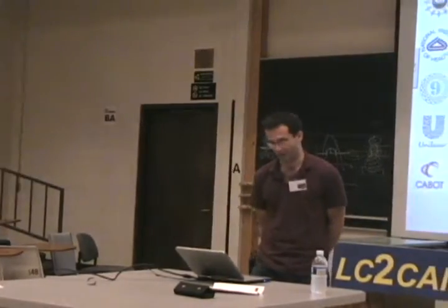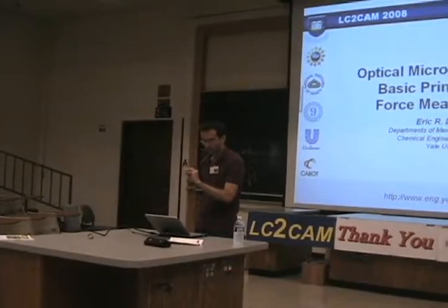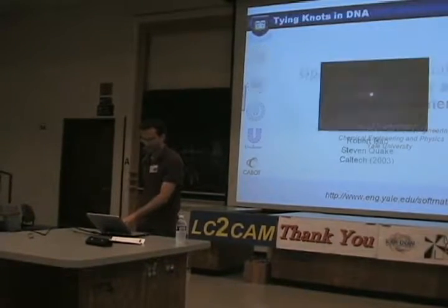Today I'm going to try to give you a mixture of a tutorial to introduce you to a field that you may or may not have heard about before, as well as tell you a little bit about the research that we've done in my laboratory. I'm going to go deeper on technique than on science, though I'm going to try to keep my discussion about technique at a scientific level, about the ideas driving the technique, not the details of apparatuses. So the core thing I want to talk about today is our optical tweezers.